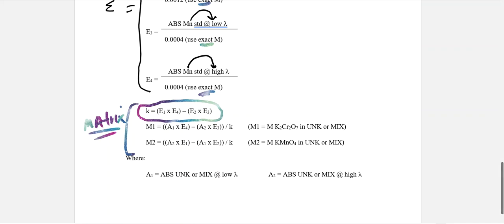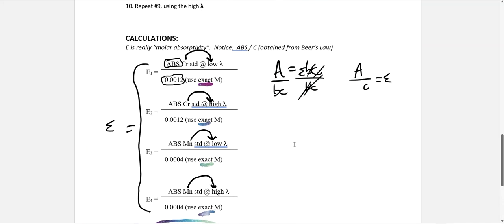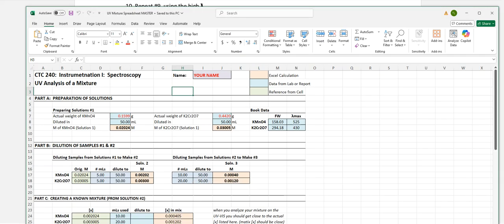So this is what the data sheet has presented to you, because it is another way to do it, and it eliminates the need of the matrix setup, because again, people just feel really weird with the matrix. But I promise you it's not. All right, so here's the spreadsheet. This is what this current year template looks like, and we're going to walk through each individual piece of the spreadsheet just so you know where these values are coming from.